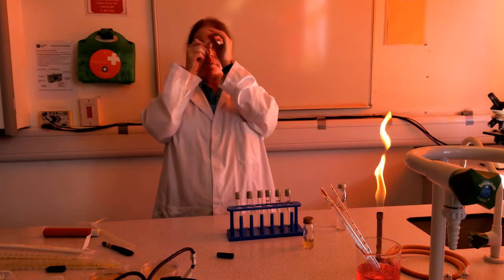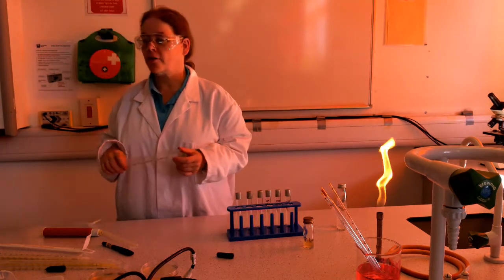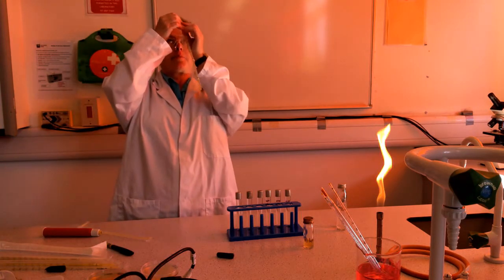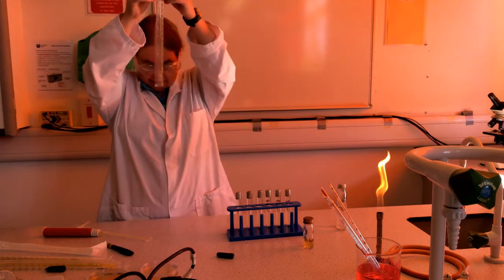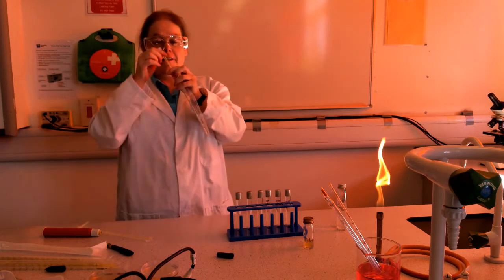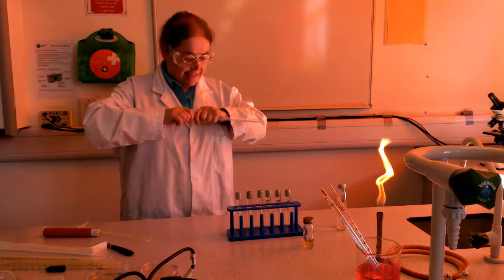The wrong end of the set. Yes, okay. The perils of wearing glasses and safety specs. Let's try that again, this time with the right end of the set. That's better. Yes, you know how you can't see anything with goggles over specs.